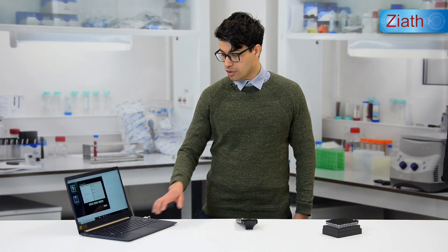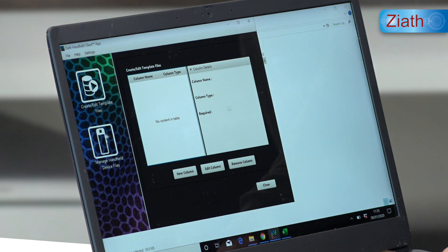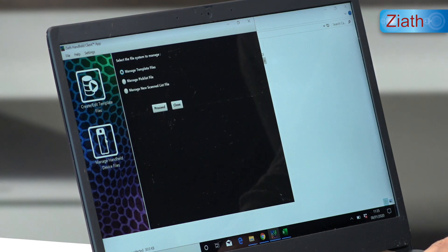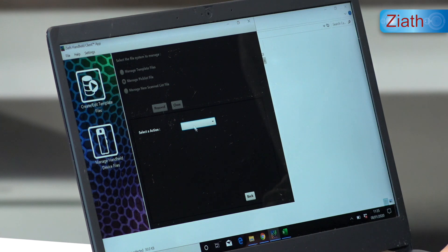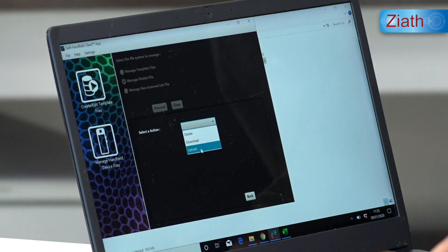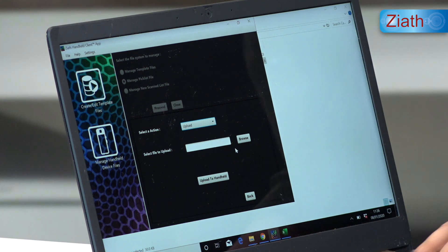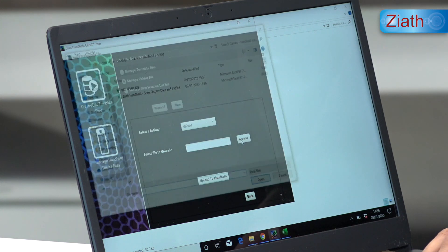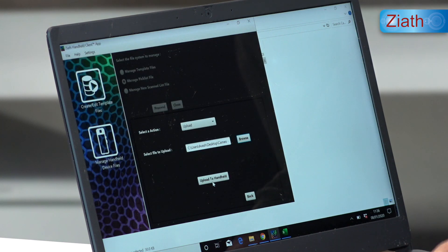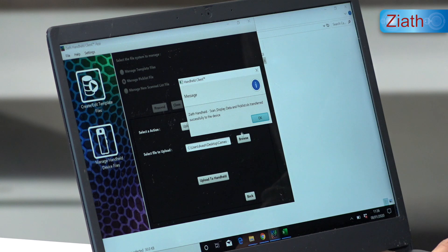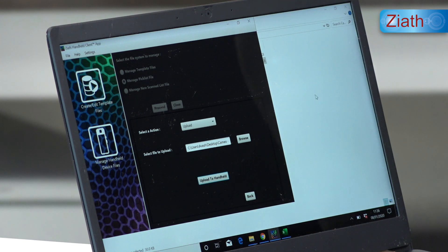To place the pick list file onto the handheld, we must go to the manage handheld device file, select manage pick list file, proceed, and then upload the file from the computer to the handheld. You can then find the Excel file, open it, and click the upload to handheld button. The file will now be placed onto the handheld device.